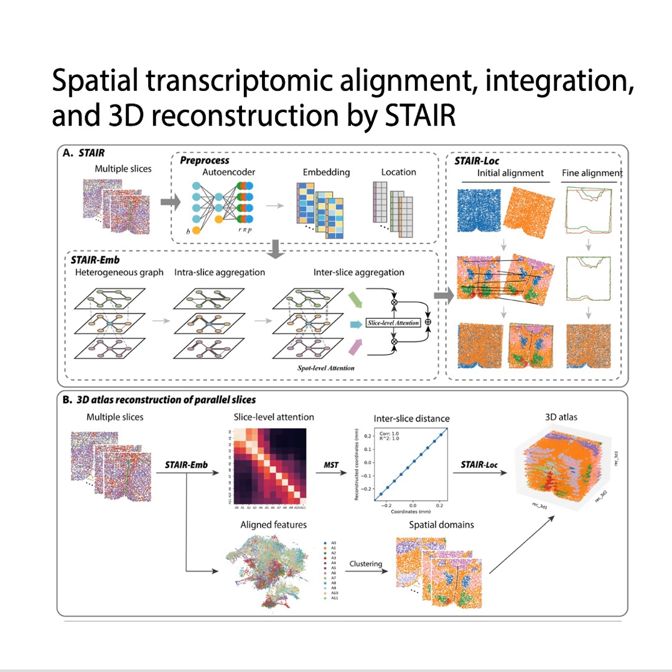And crucially, this data set had the true measured z-coordinates. So they had the answer key. And how did it do? Testing STAIR's attention-based reconstruction against that ground truth, it yielded virtually perfect results.